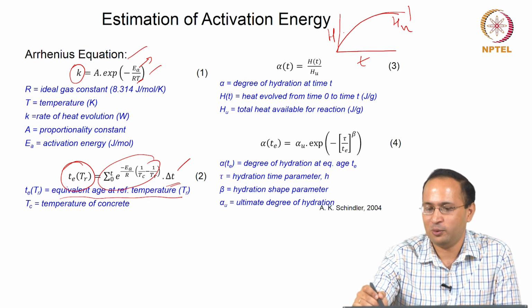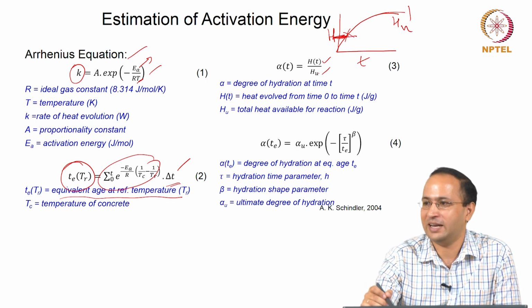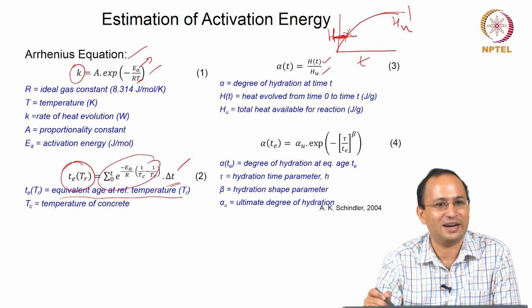Now, if I want to know what is the degree of hydration, simply I do HT over HU. HT I know what is the heat evolved at that particular time over HU, that gives us the degree of hydration.